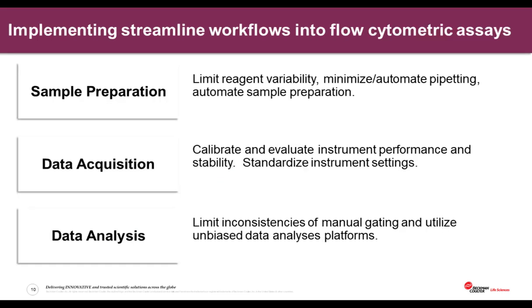So now that we've discussed the fact that there is rigor and we have the scientific method that backs it up, and we've also discussed the fact that the scientific community discusses guidelines and workflows, we're going to show you how to implement streamlined workflows into your own cytometric assays. And this is quite simple because based on the chart that I previously showed you, you can see the components of irreproducibility to the actual global problem of reproducibility.